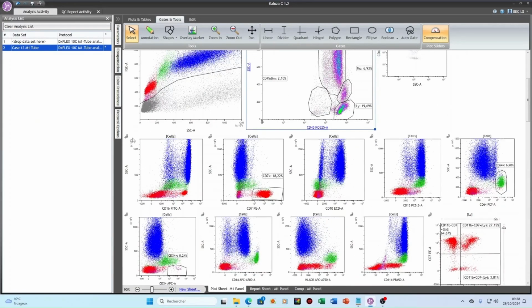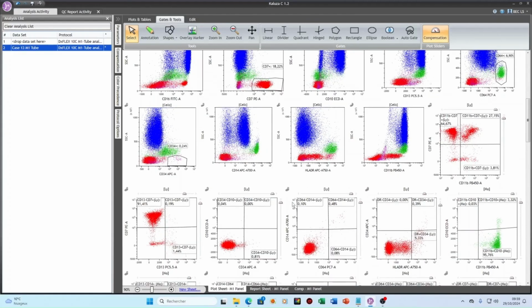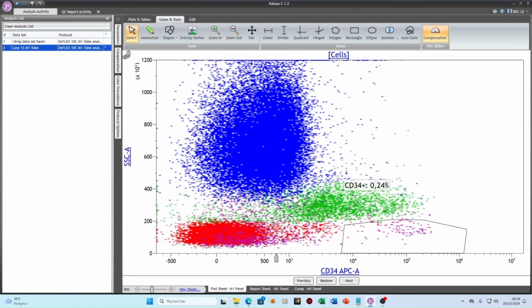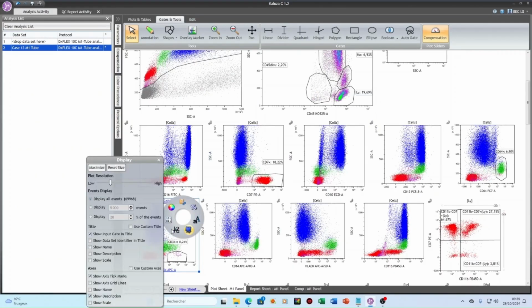And we see here the expression of the different types of cells, with the CD7 for some cells. We have the CD64 for the monocytes. Normally there are no CD34 cells. And what's nice here, I can show you also a good option on the system. So for example, let me just create a new region. So I will create here just a region.